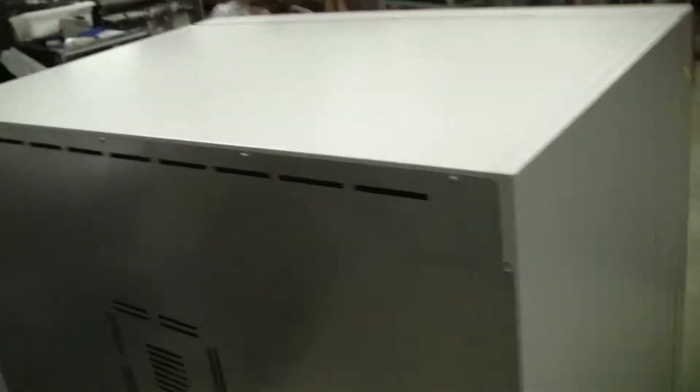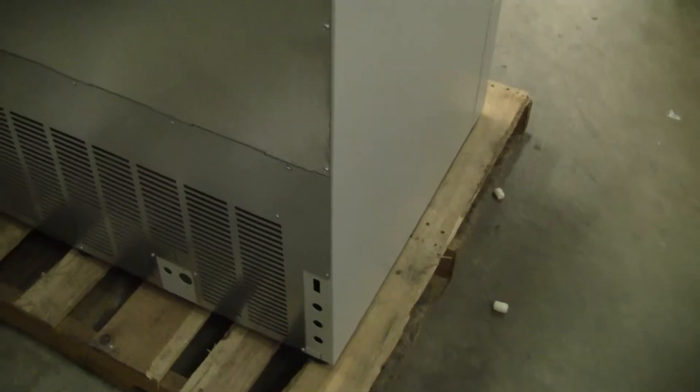The rear of the unit: 115 volts, RS-232 port in the back. The other side here. Very nice.